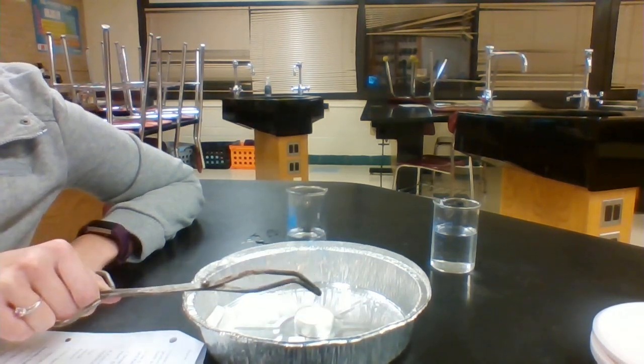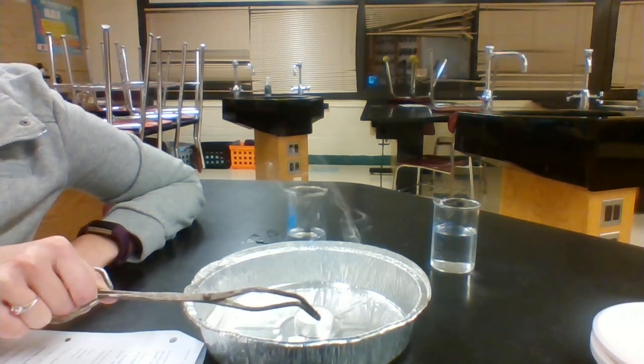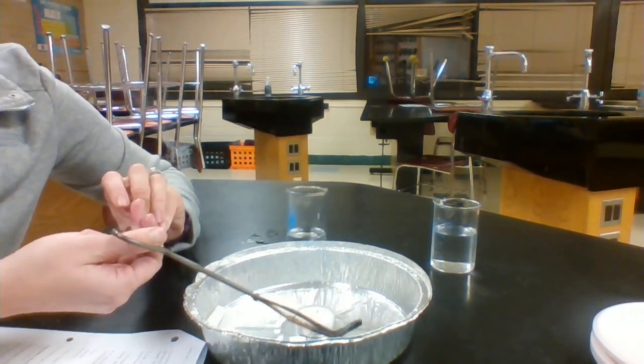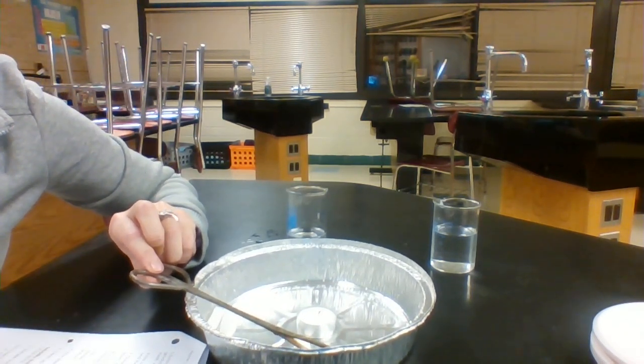I'm going to just put it into the pie tin. And then what I'm going to do is just take the tongs and I'm going to put the candle out. I'm going to leave everything here to cool. And you can go ahead and you can fill out and answer the questions in your science packet.